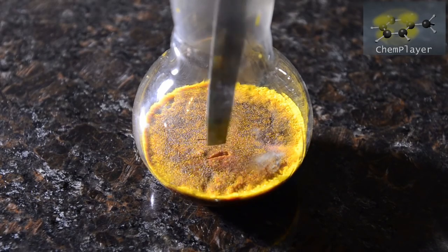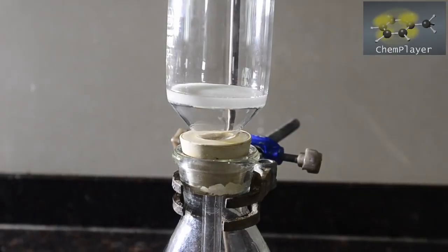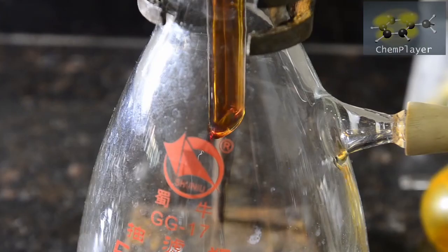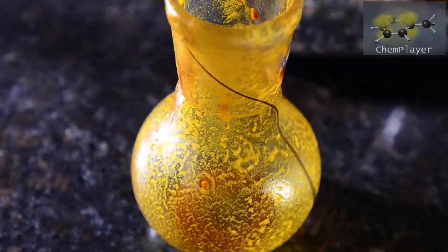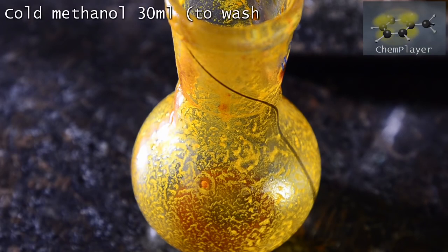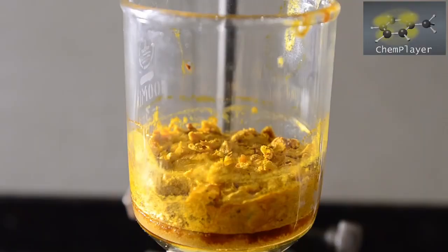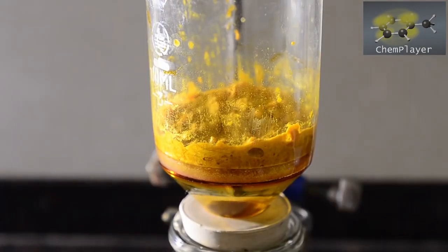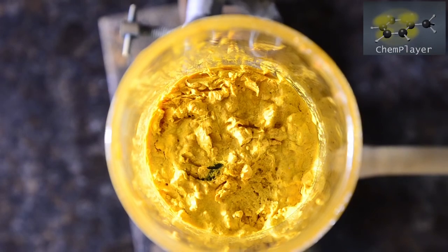It's pretty solid, as you can see, so we set up for vacuum filtration and scraped the solid into the center. We washed the reaction flask out with about 30 ml of cold methanol, and then used this to thoroughly wash the yellow solid. And then dried the yellow product thoroughly on the pump.